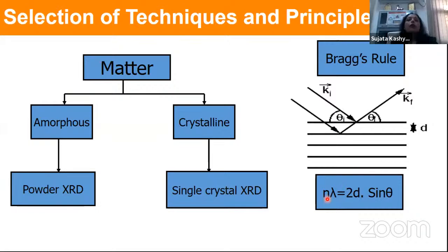Now comes the question: what is the technique and what is the principle behind this, and how can we choose whether to go for powder XRD or single crystal XRD? The principle for both powder and single crystal XRD is Bragg's law.